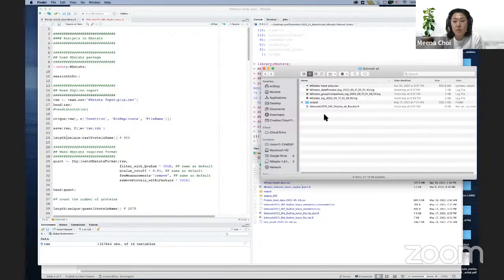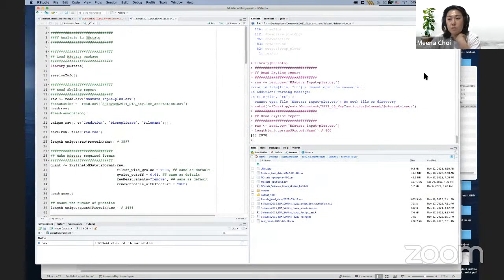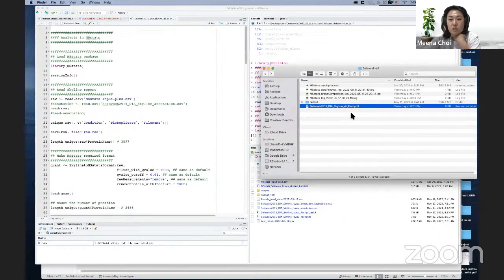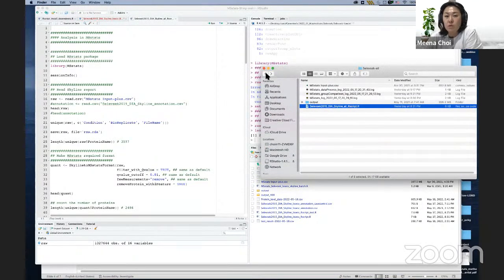At the end, I want to show you how much different the low CV cases are in all cases. But before I move on, do you have any questions? I think Devon already answered all of the questions.